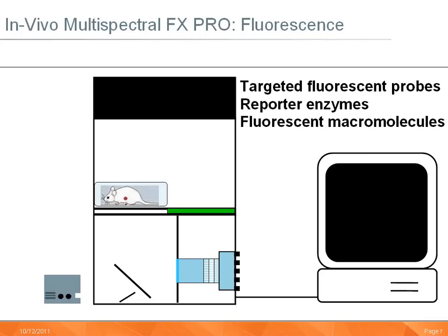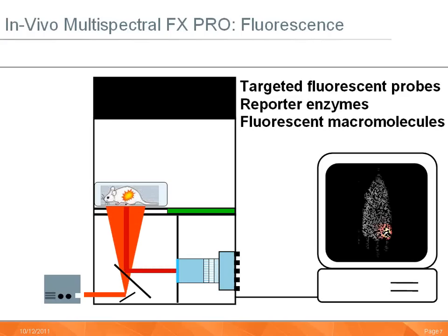The system operates on an inverted illumination and detection platform. The sample resides in a sample tray where both thermal control and anesthesia may be ported. Illumination is via a xenon excitation source with a 29-position filter wheel. Detection is made at a right inverted angle and via a cooled CCD detector. The detection path includes a 4-position emission wheel.